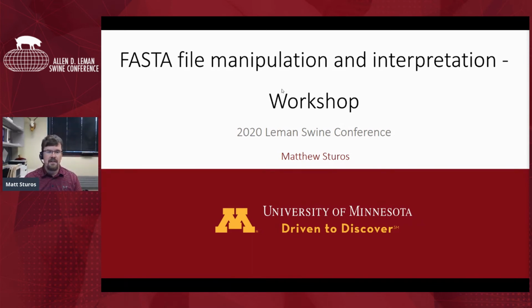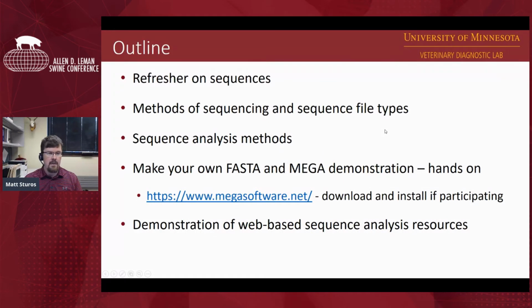So this is meant to be a hands-on workshop. I'm going to give some basic information. If you're already a molecular epidemiologist, you might not need to stay tuned for this part, but if you wanted to learn more or refresh your memory about sequences and sequence manipulation that you can do yourself, we'll go on a lovely ride. So I'm going to give some refresher, or maybe it's new information, on what sequences are for you. Briefly touch on the methods of sequencing and the different sequence file types you might run across.